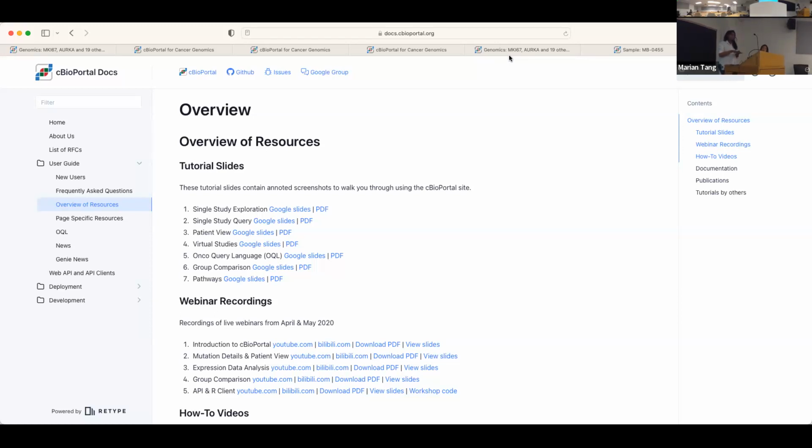Without understanding our data sets, there's no way we can improve. So this whole tutorial series is hopefully to lower the threshold so that UMAP and tSNE don't look so scary. They are not that scary actually, but it can be intimidating.